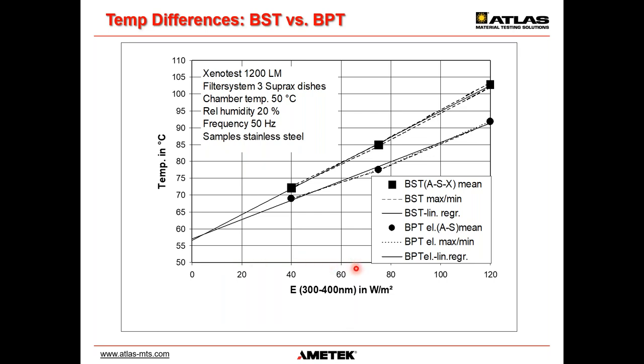On the x-axis, we have the increasing irradiance range, and you see that the difference between the squares, the insulated, and the uninsulated, the dots here, becomes bigger and bigger. At moderate irradiance levels, maybe 3-4 degrees C, at 60 watt, easily 5. Beyond 60 watt, maybe 7, up to 10 degrees C difference. So that's my reminder. Be very careful to have the correct black panel sensor installed.